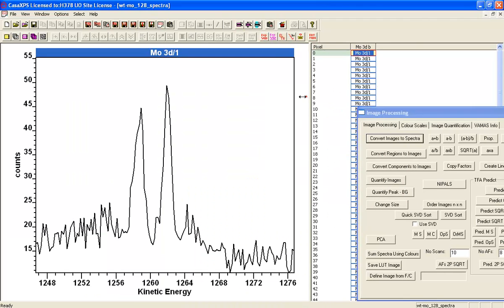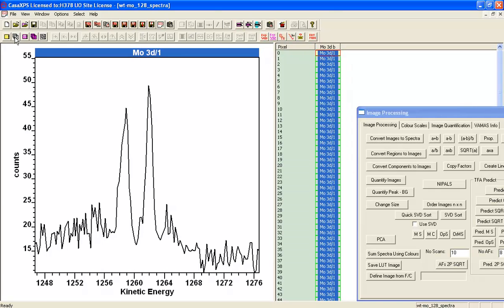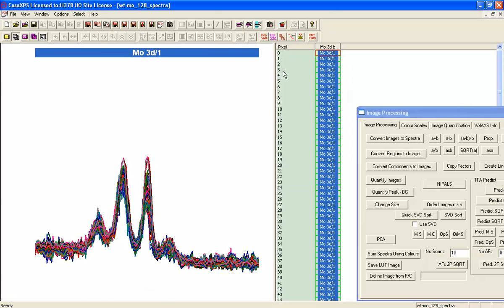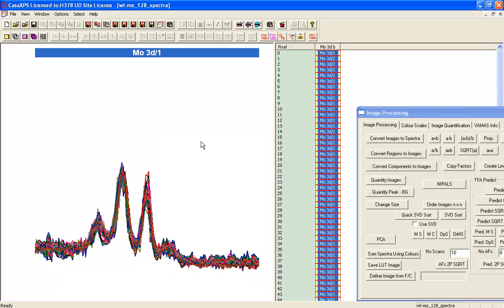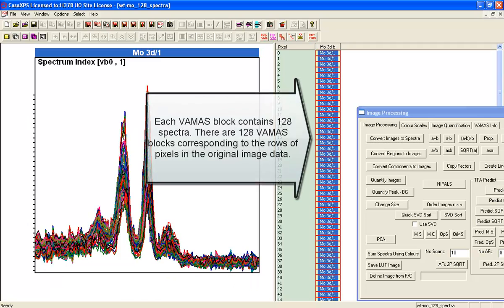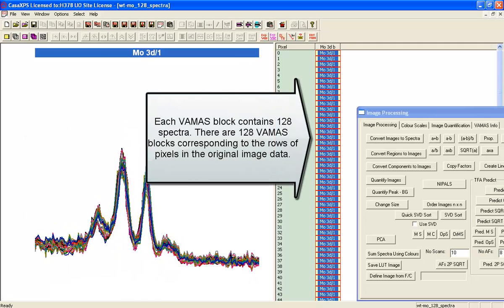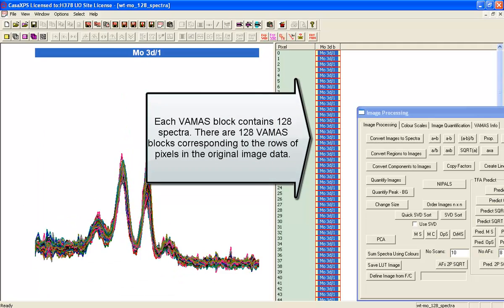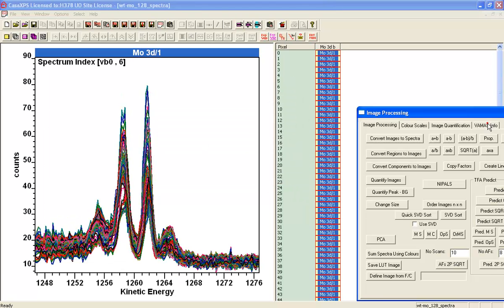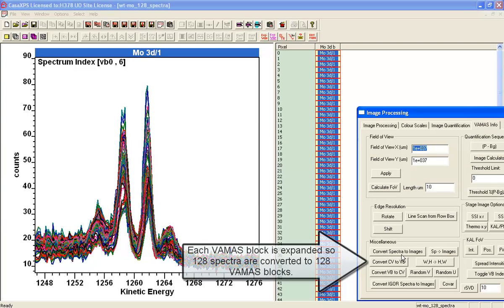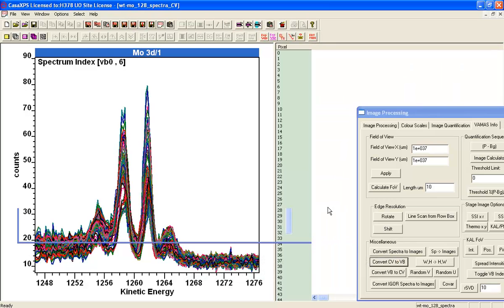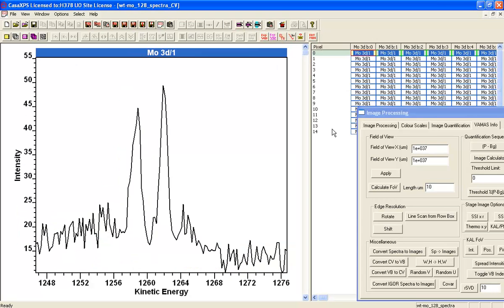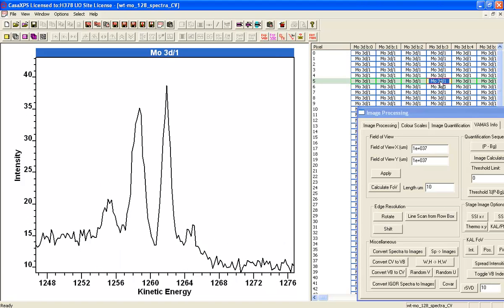Here I can once again, this is a set of VAMAS blocks. Each VAMAS block contains a row of spectra corresponding to the data in the images. If I step across by holding the control key down, we can see these spectra that are within these VAMAS blocks. Alternatively, what we can do is go over here and say convert the corresponding variables. That's where all these spectra stored to individual VAMAS blocks. When I do this, I create not a column of VAMAS blocks, but an array of VAMAS blocks. And within each VAMAS block, there's an individual spectrum.